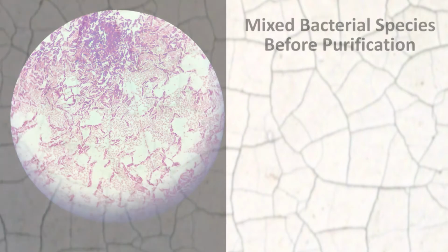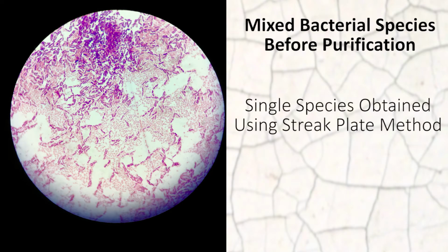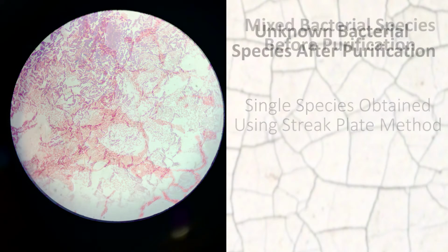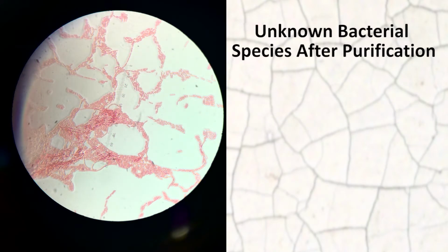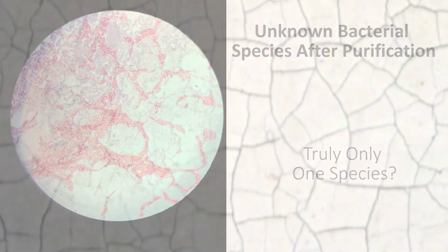This is easy with macroorganisms such as fish. However, in the world of microbiology, numerous bacterial isolation, purification, and culturing steps would be required to obtain a pure culture. Even with gram staining and microscopy, it does not guarantee a pure culture, which would reflect in the result of the DNA sequence. The outcome of DNA extraction determines the quality and success of DNA sequencing.